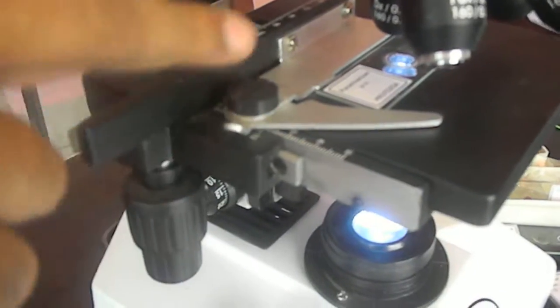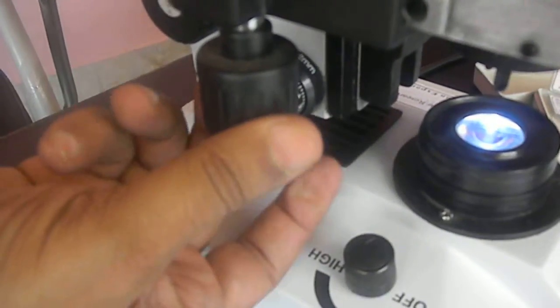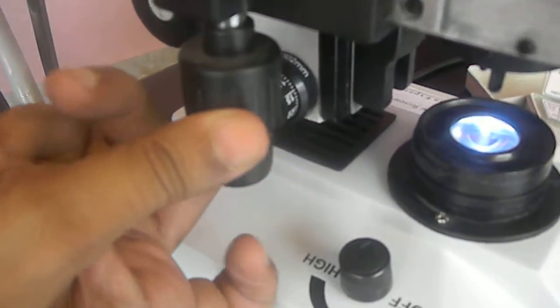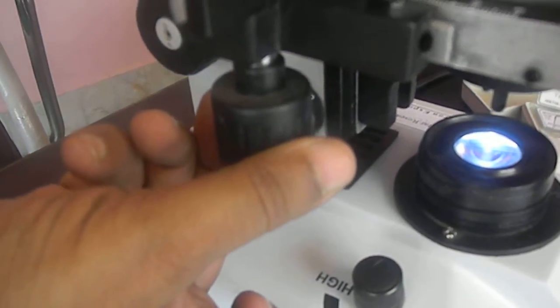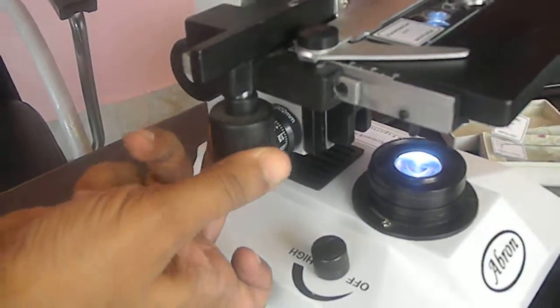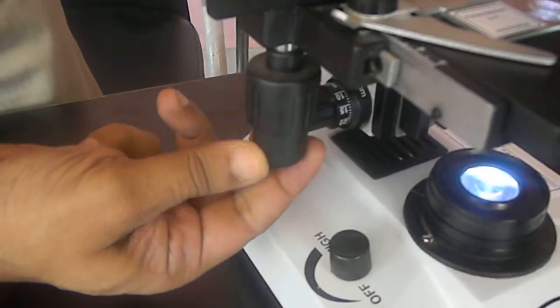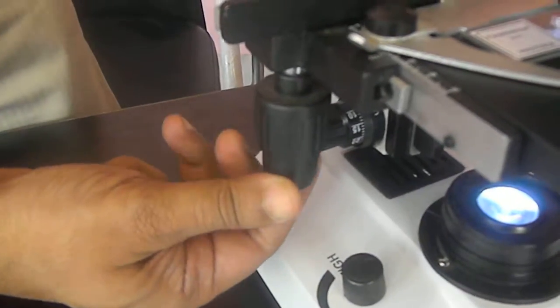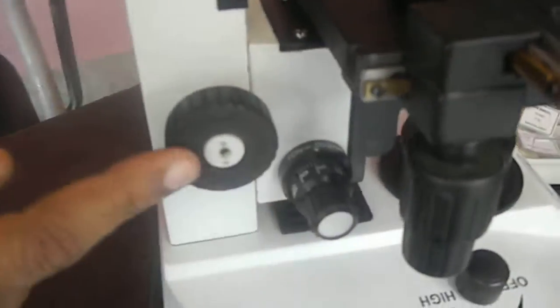Slide can be put here. There is a focusing coaxial stage and this is for moving forward and backward. Forward and backward and then this is for making left and right. There are two parts.